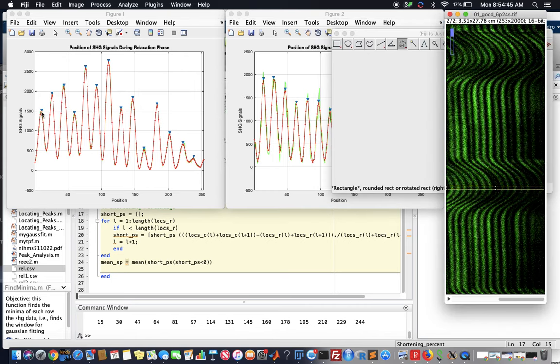Through intuition, we know that this band here marks this part there. If you really wanted to count them down, you would see that 1, 2, 3, 5 is about the second highest peak, and 6, 7 is the highest one. So 1, 2, 3, 4, 5, 6, 7. We know by intuition that this one here is this peak here, so we're going to want to start off there.